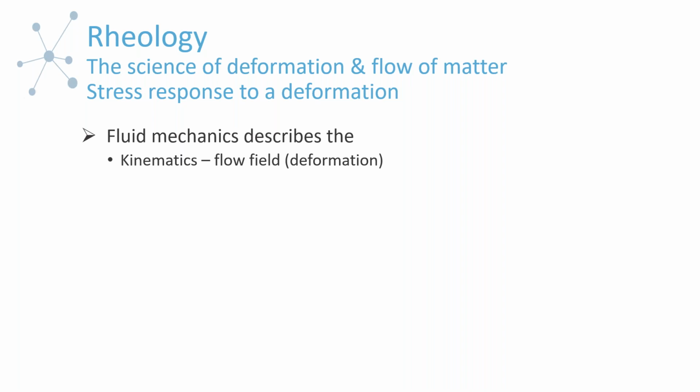instantaneous strain. So we need to address the kinematics, and that's just the terminology that's used to mean the flow field or the deformation. And then we need to address the stress distribution that would be generated upon this deformation. And this is just referred to as the dynamics. So we're going to have the kinematics and the dynamics, which is just the flow field representation, and then the stress distribution representation.